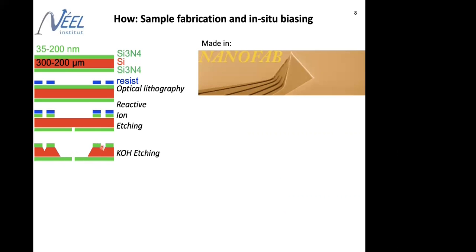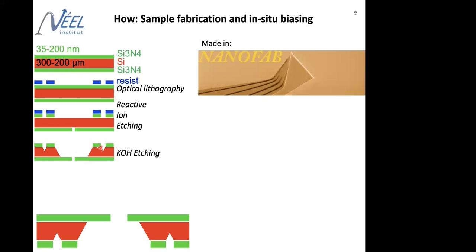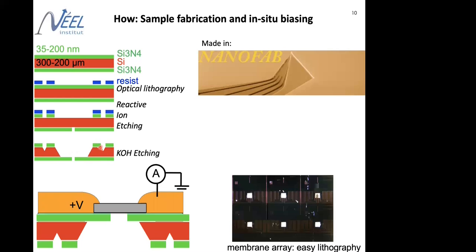And between the chips, we also etch these little V grooves, allowing us to separate the chips from one another after fabrication. So then we have our membrane, planar or with holes. We put a nanowire on by dispersion typically. And then with electron beam lithography, we write electrical contacts to this nanowire.